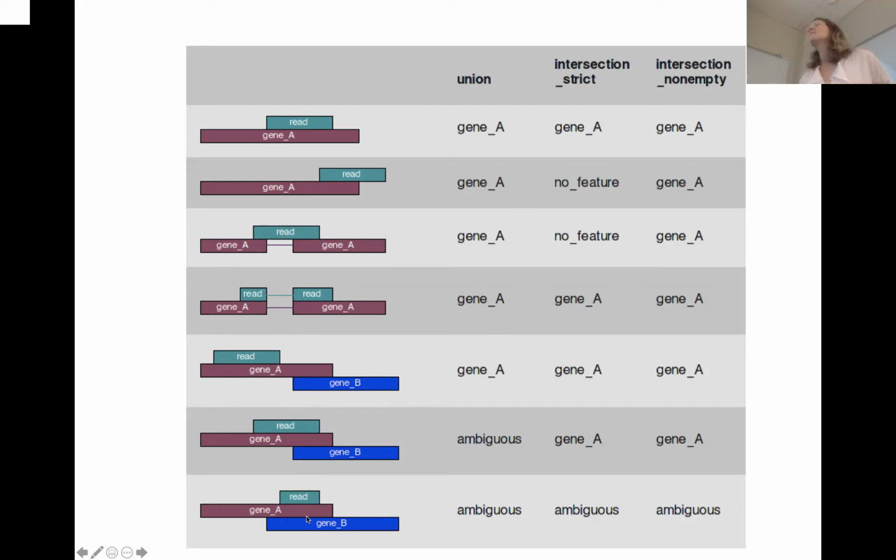This actually can be solved by strand-specific sequencing, but our data is not strand-specific. But now you can order RNA-seq libraries, I think they cost a little more, that tell you if the transcript originated from the forward or reverse strand. So I think some of that ambiguity can be sorted out now, but in our data, we're going to consider that ambiguous. So these are the three strategies you can choose from.